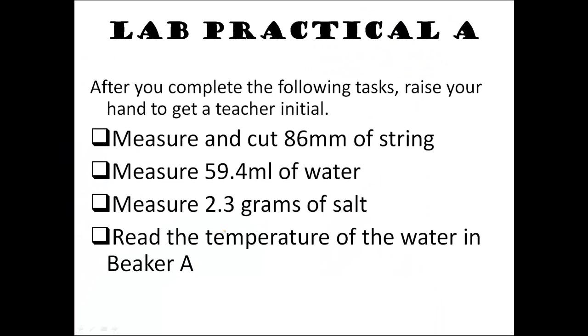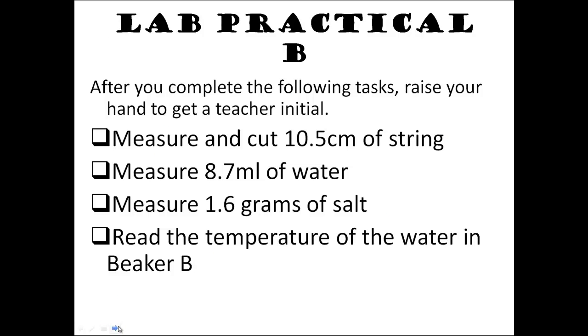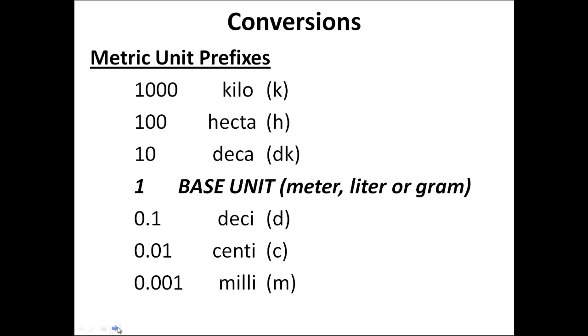I'm going to have my kids do two lab practicals. One of the groups is going to get this, where they have to measure length of string, they have to measure volume of water, they have to measure mass, they're going to use a triple beam balance, they have to look at the temperature, raise their hand, and get their initials when they get that. The other group's going to get this one, same type of thing except different numbers. I'm probably going to come up with a C group as well. Then we're going to talk about these where we actually change numbers.